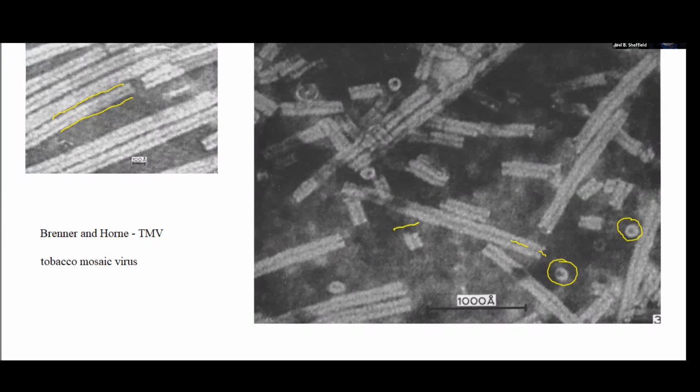And if you look closely at a region like this, that is a little side view, you might imagine that what you're seeing is something maybe that looks like this, with the idea that this would actually go all the way around and form some sort of cylindrical structure based on these subunits.